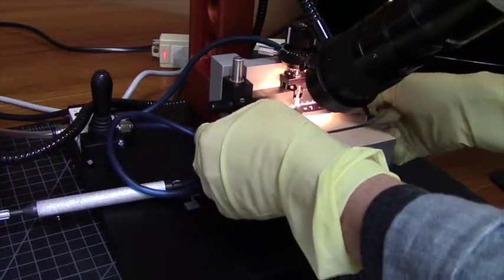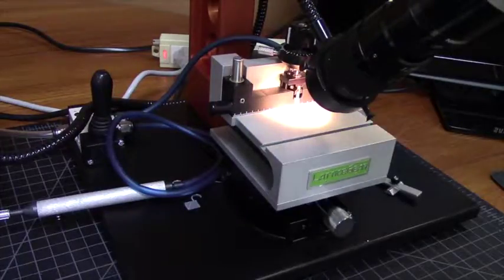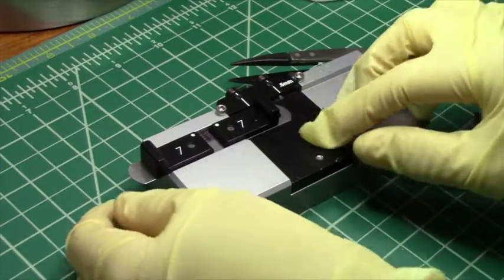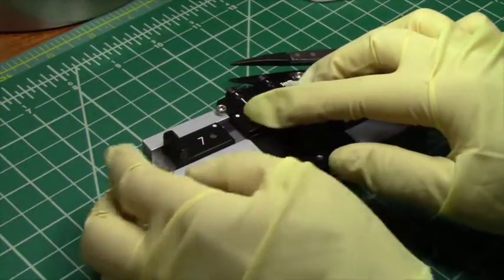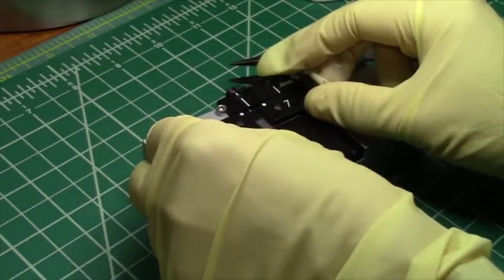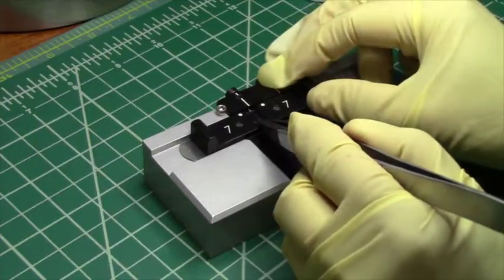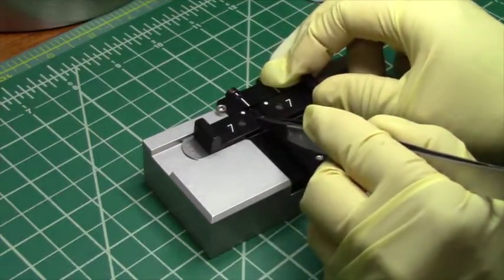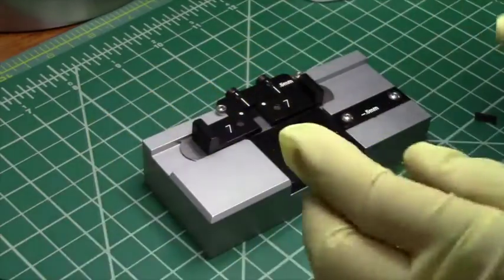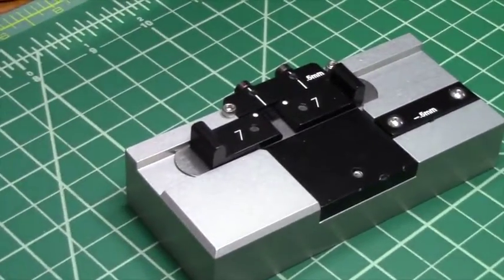Now I'll transport the holder back to the small sample cleaver. Once the sample is in its hold down and on the small sample cleaver, I'll now move it over to the cleaving pin. I'm looking through a magnifying lamp and I'll use my soft tip fiber tweezers to push the sample up over the cleaving pin, and now I'm going to push gently on the white dots that you see on the small sample cleaver.